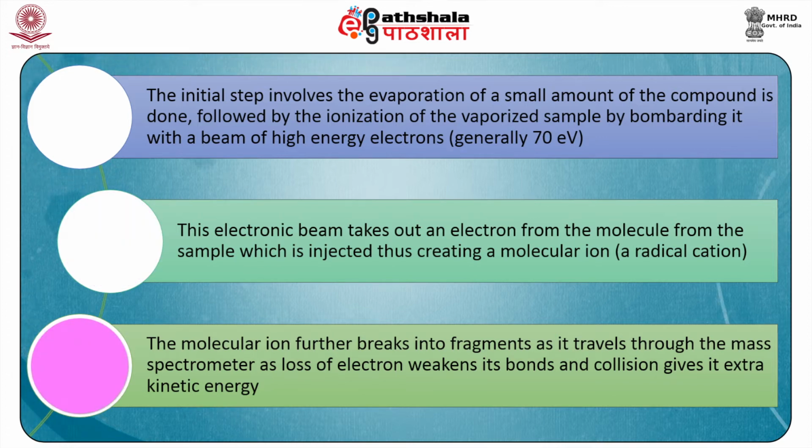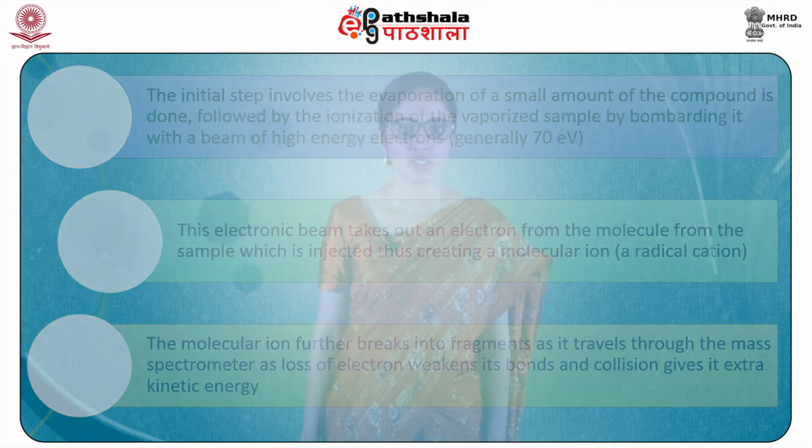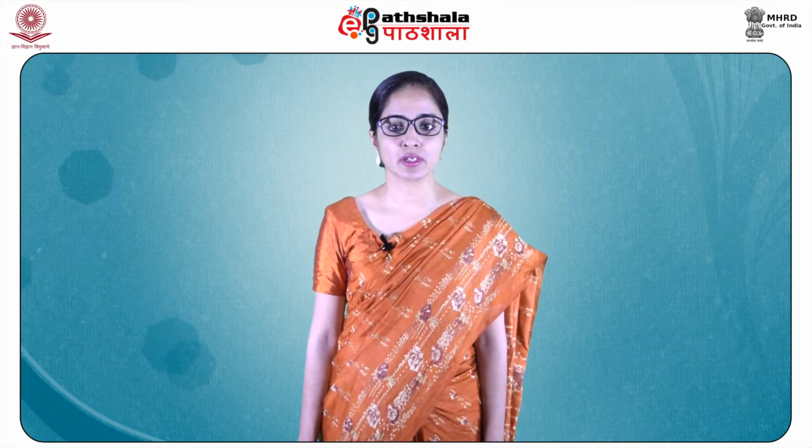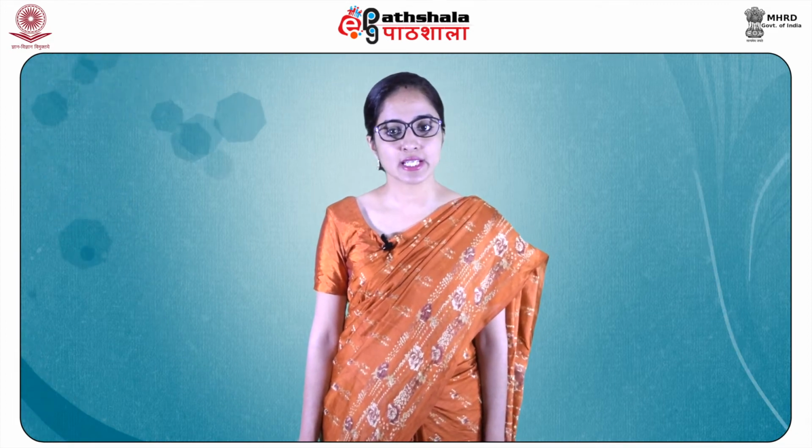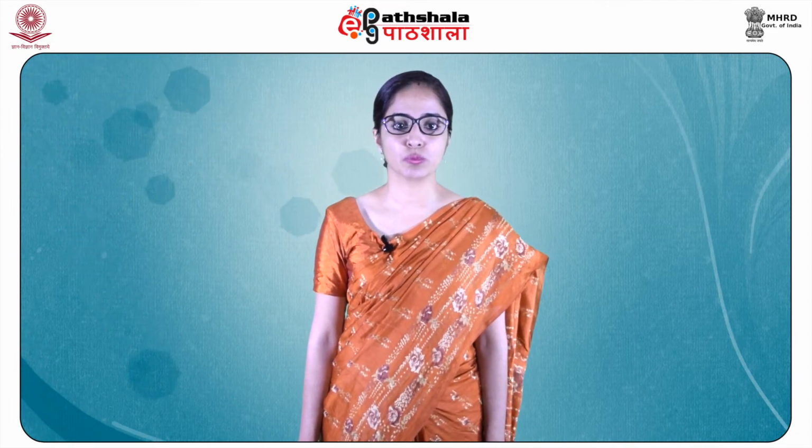The molecular ion thus formed further breaks into fragments as it travels through the mass spectrometer, as loss of an electron weakens its bonds and collision gives it extra kinetic energy. The positive charge causes the radical cation to accelerate into the analyzer tube.